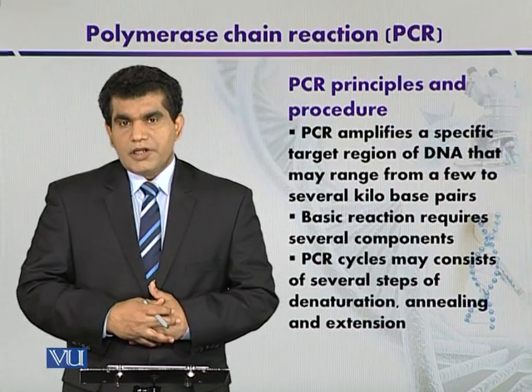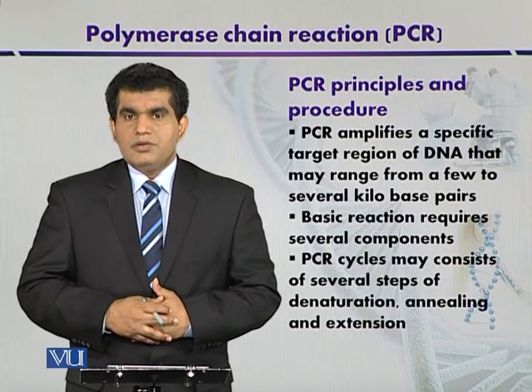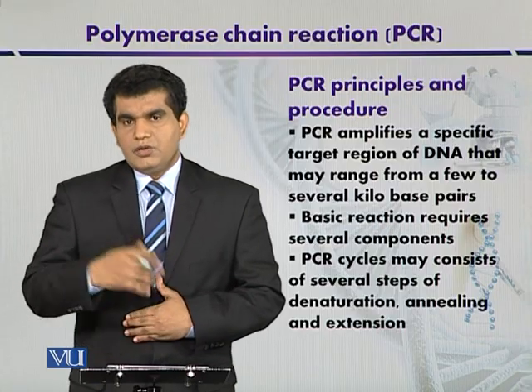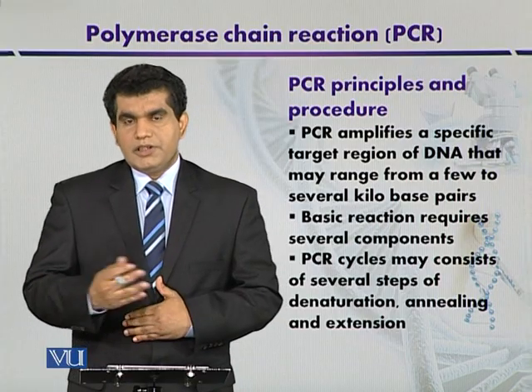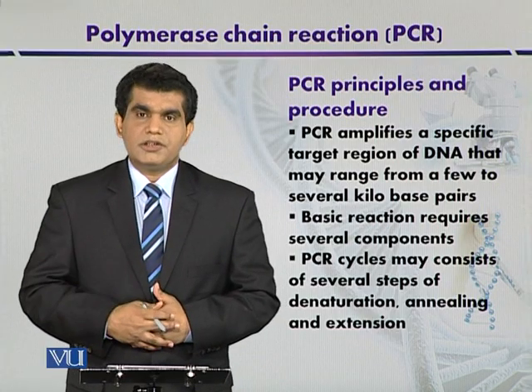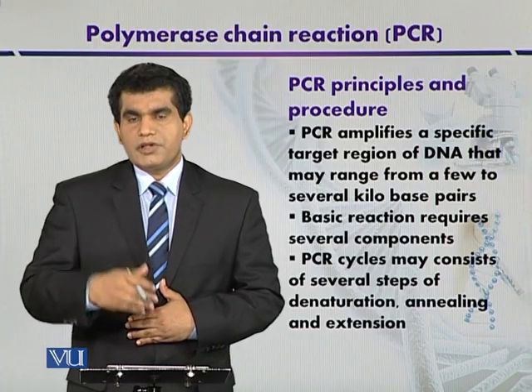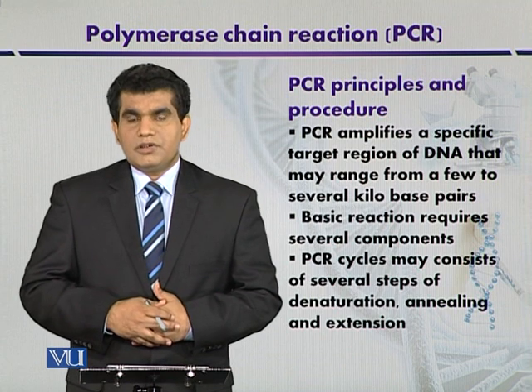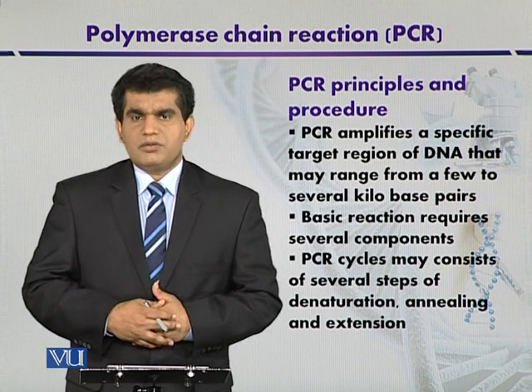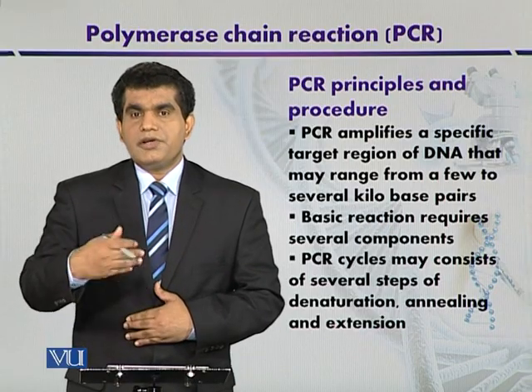In addition to that, the dNTPs, that is deoxynucleotide triphosphates, you can also say that, and in short we can say that different type of dNTPs that are mainly 4 in case of DNA, and they are also added in a particular concentration like maybe 20 micromole in case of this reaction mixture.